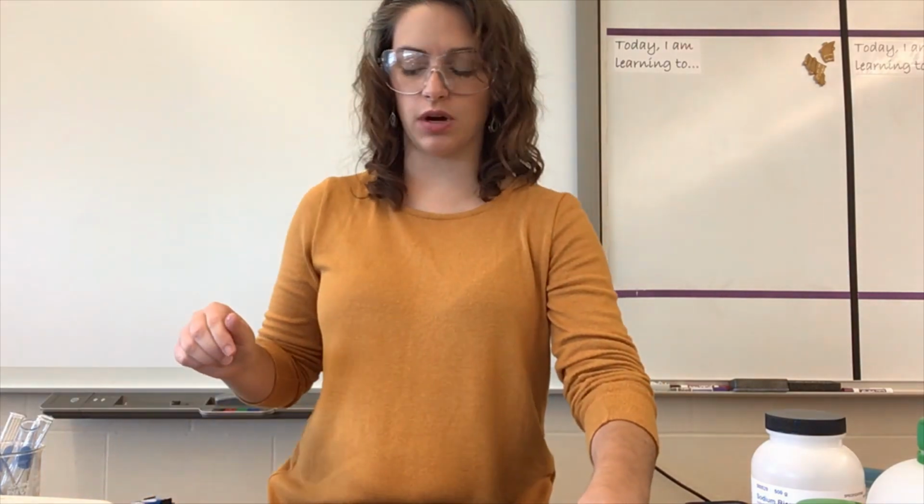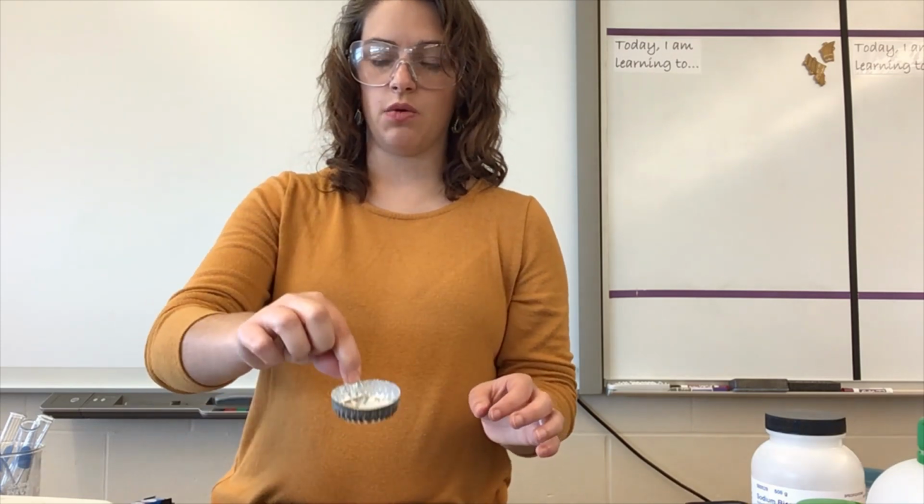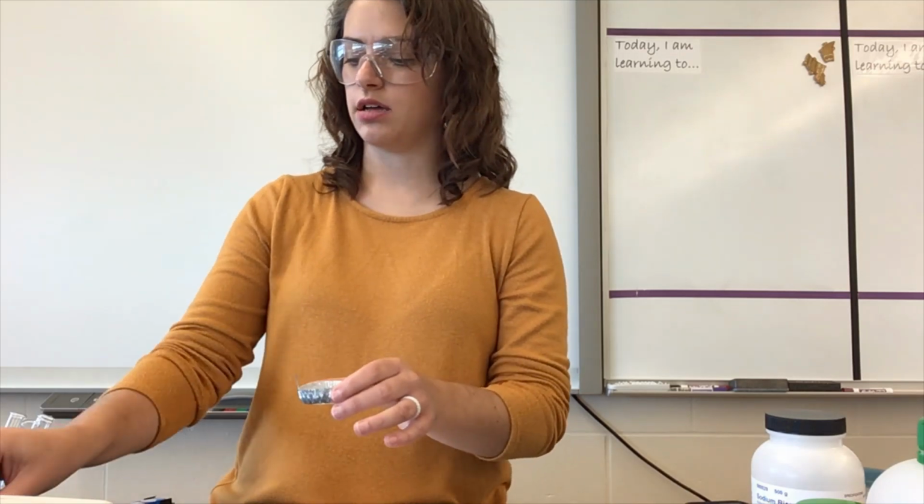Okay, and then the last one is to look at melting point. So we're gonna do the same thing. I'm gonna take my weigh boat or my aluminum dish of urea and I'm gonna pop it on my hot plate.